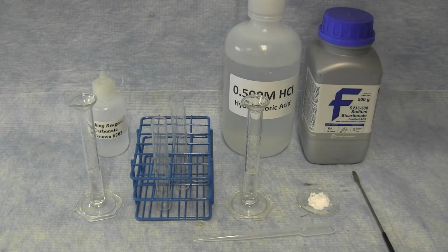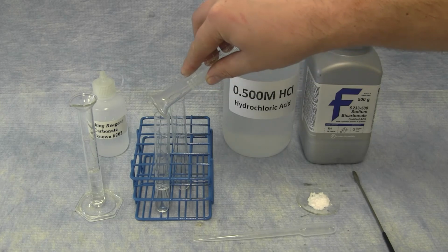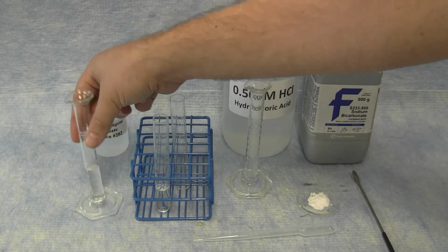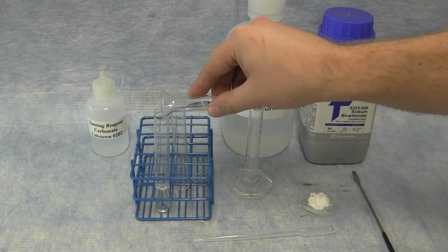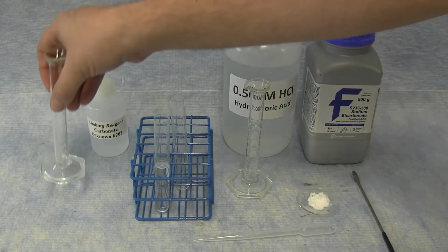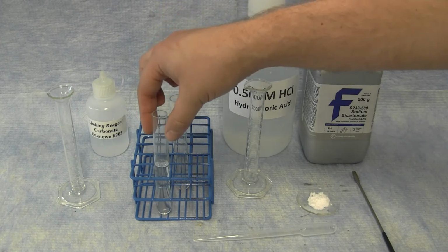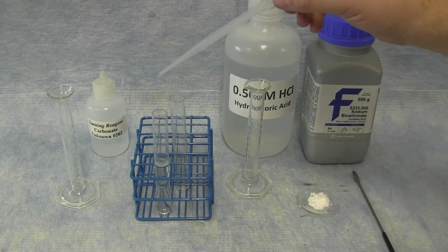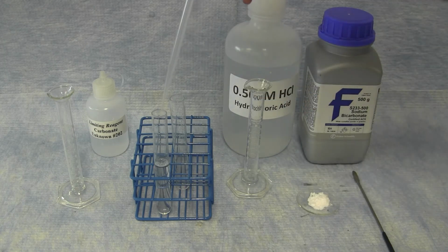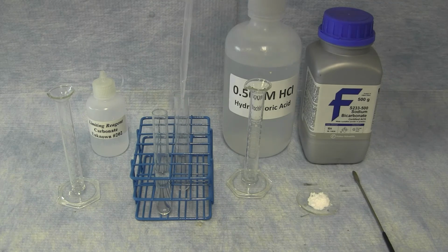You'll be taking 5 milliliters of each solution and combining them in a small test tube. You can see the slight fizz when the reaction occurs. You can then take a portion of your reaction mixture and place that in a second test tube.